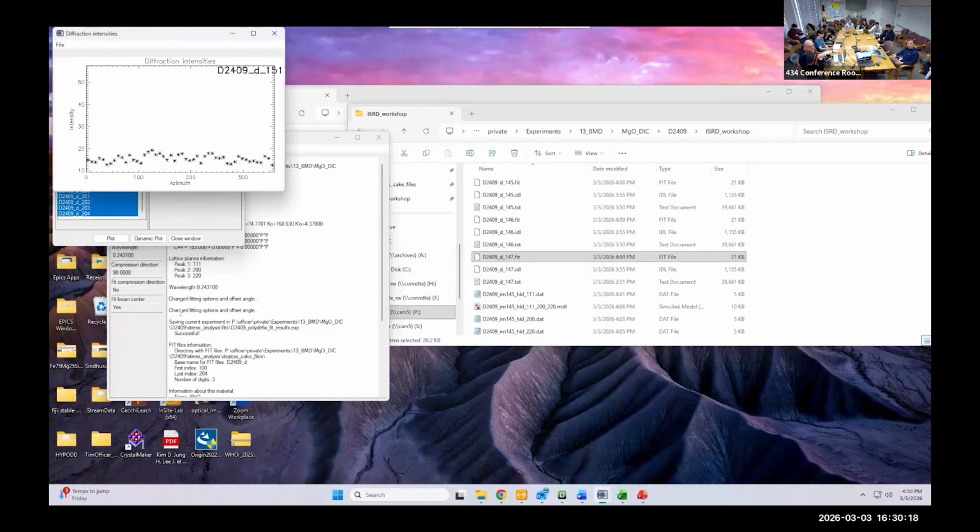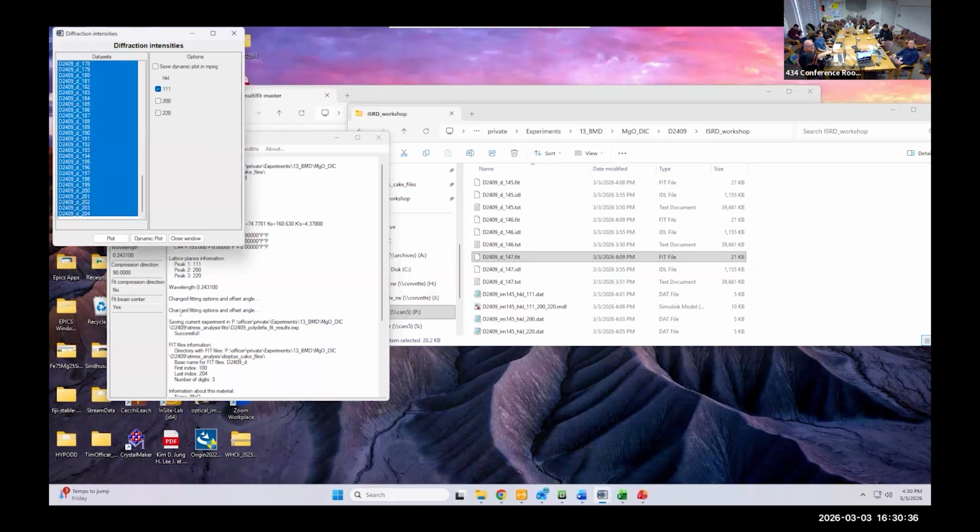It wasn't until later though that we picked up on something, around 170 something. There's something there, it's not well resolved, but yes. It is, because that should be off angle, right? But it looks like it's almost different. This is all because of what we call the slip systems, right?